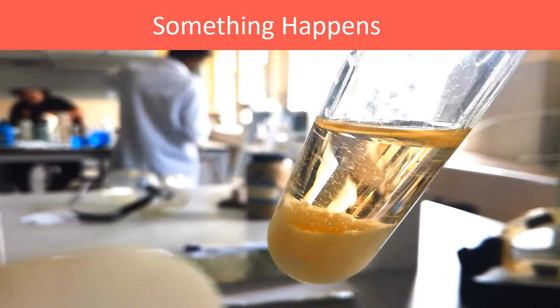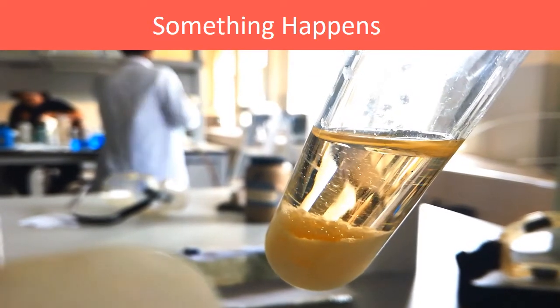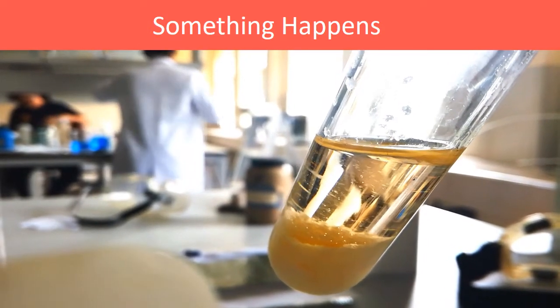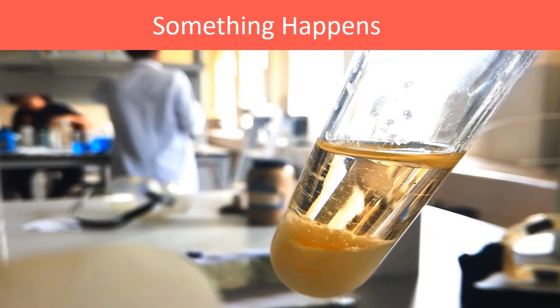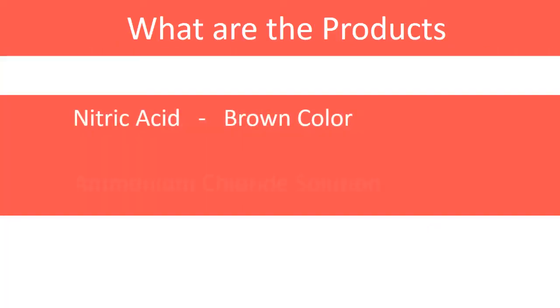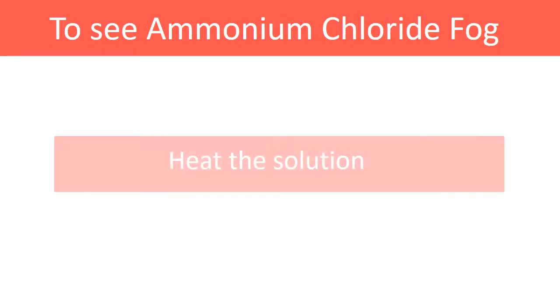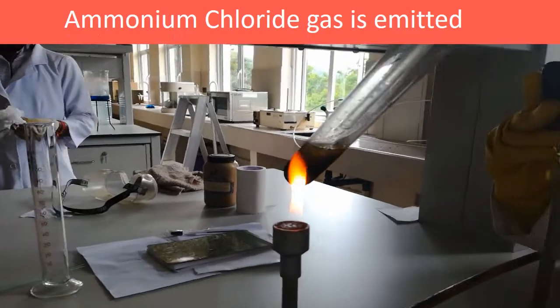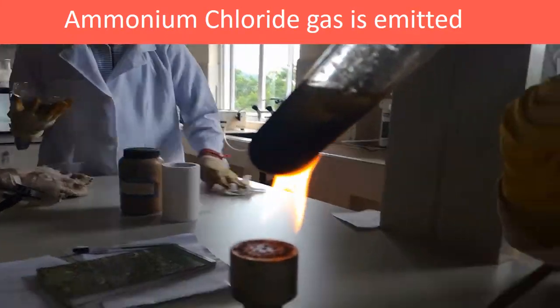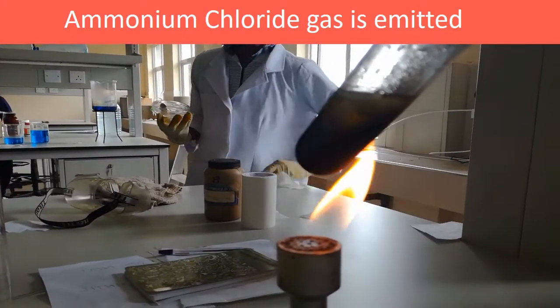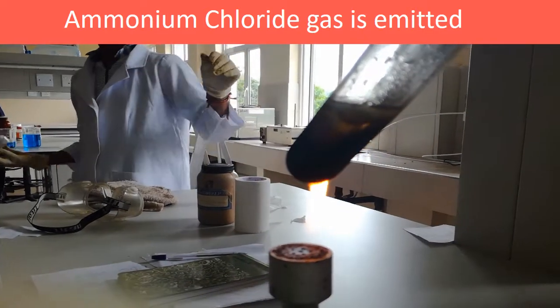After reaction with hydrochloric acid and ammonium nitrate, we can see nitric acid is produced with brown color. And also, through the liquid and test tube, a little bit of fog is going in the upward direction.